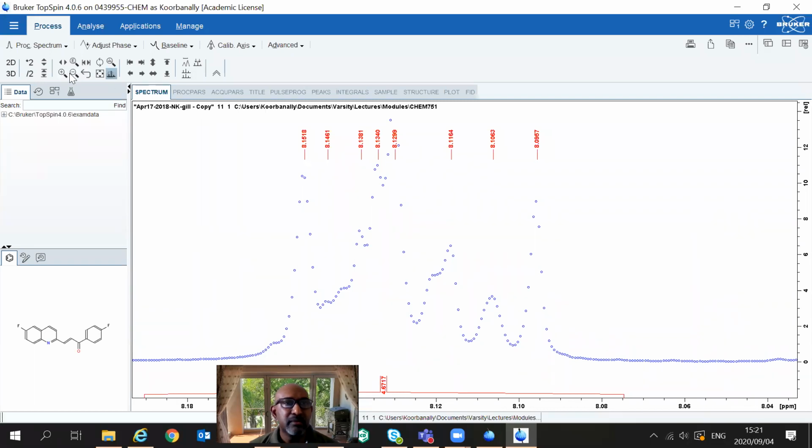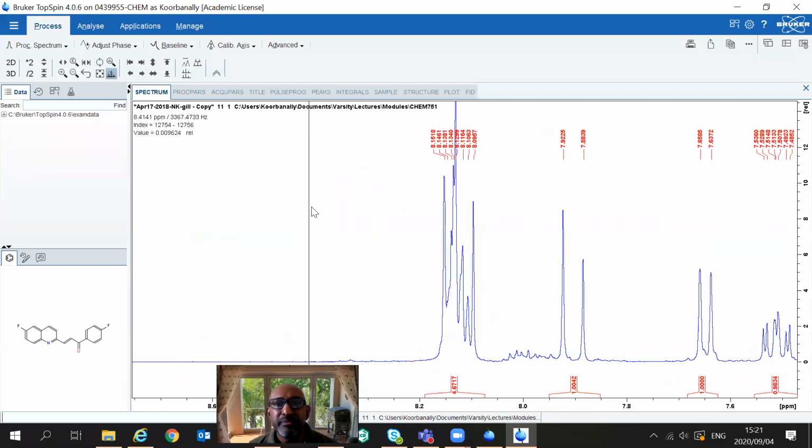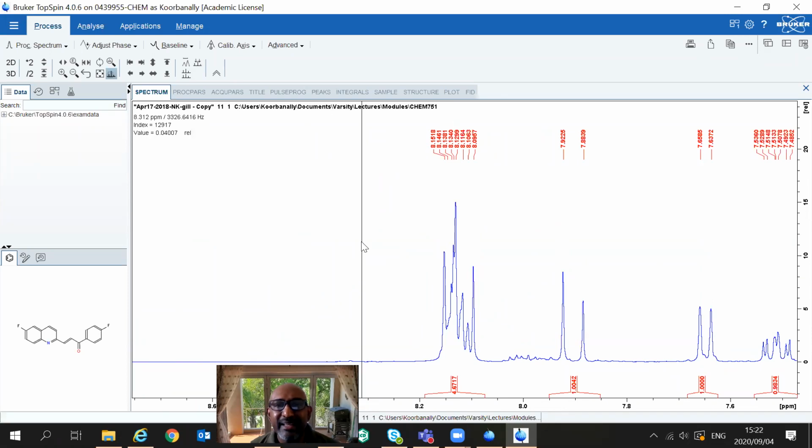All right, so what we've actually done now, and what I've said, is that if I look at this peak here and this peak here, that's your peak that's coupling to this big one.